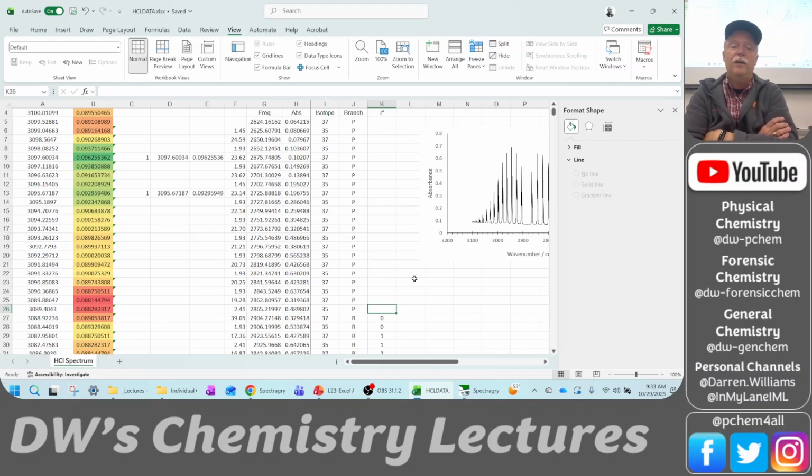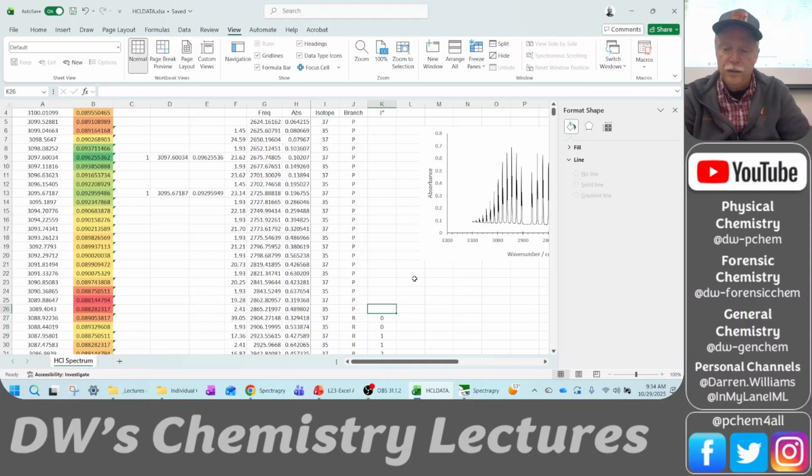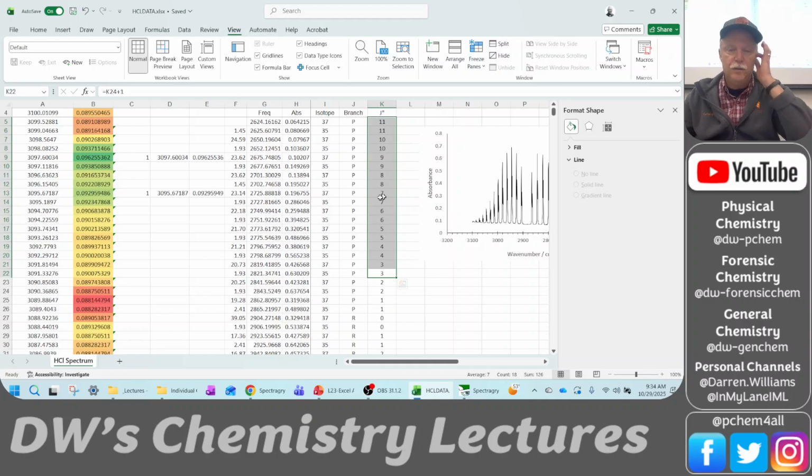So we have a P1 line, and the upper value is 0. So we're starting at J equals 1 in the lower vibrational state and going to J equals 0 in the upper vibrational state. So this is 1, and so is this one because of the two isotopes. And then it's 2 and 2 and so on. So I'm going to say this equals the 1, 2 below it plus 1, and I'm going to copy it up. Okay. So there's the 3, the 4, the 5, the 6, and so on.